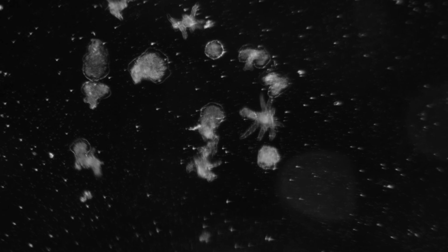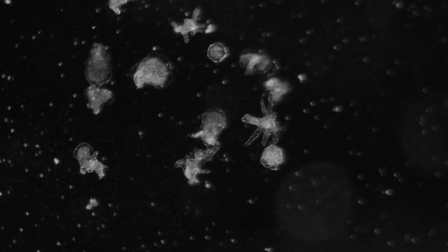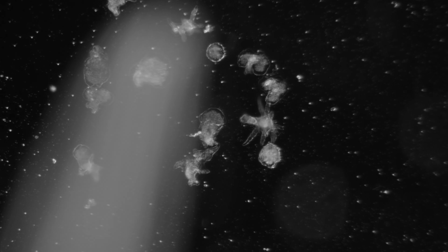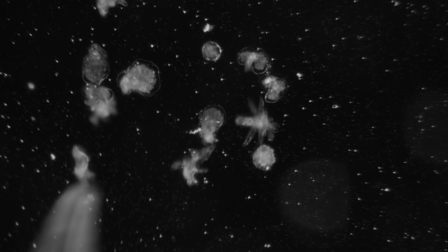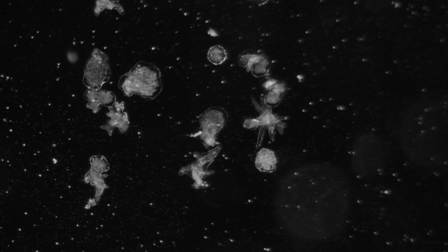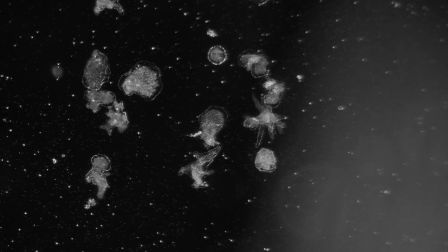And in this state they take many forms, can be very elongated, this one as well, and this one already adhered to the glass, so you can see there is the hyaline already stretched around.